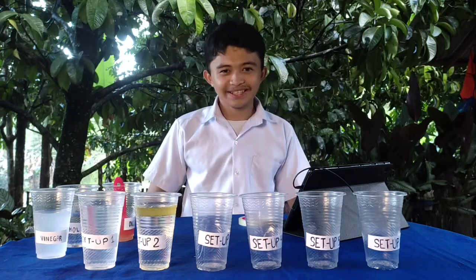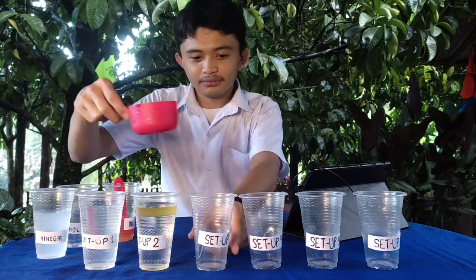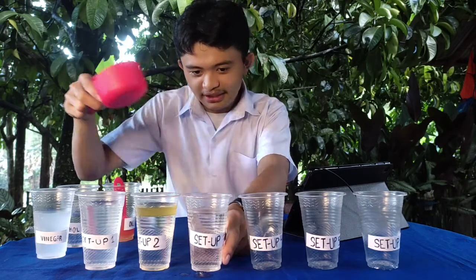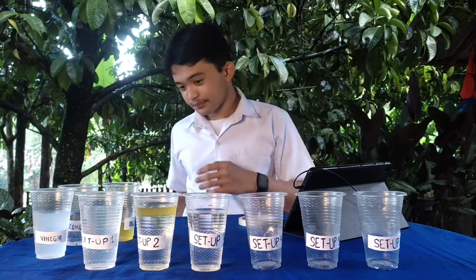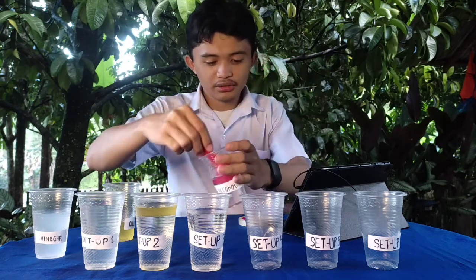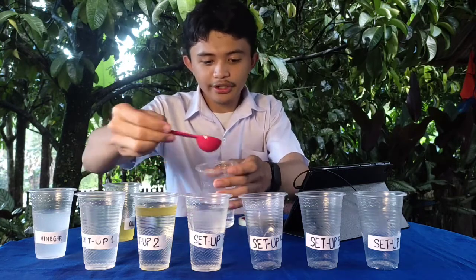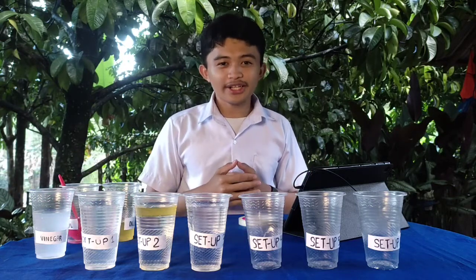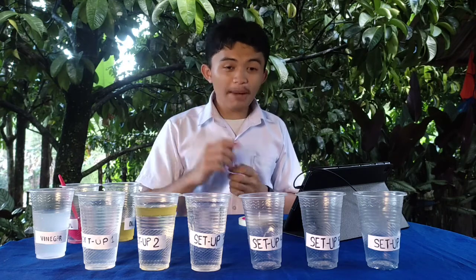On to setup number 3. Let's add 1 cup of water and 1 cup of alcohol.